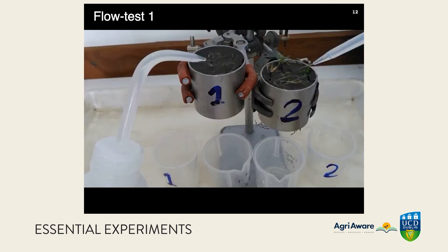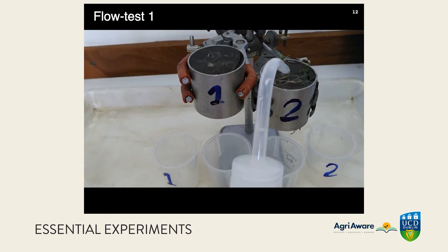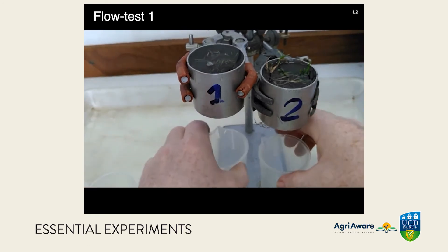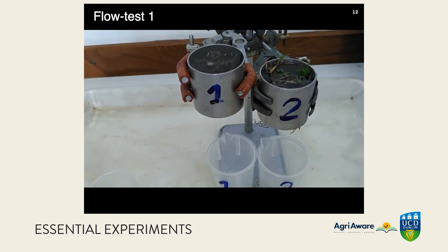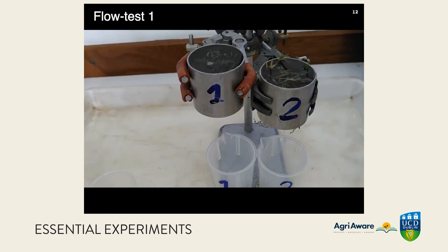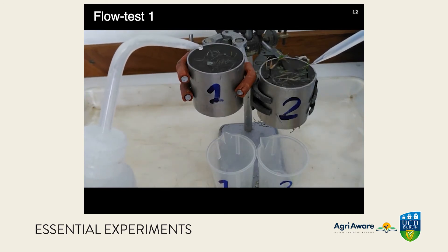Now starting flow test one. Getting the ring completely filled with water so the meniscus is bulging above the top edge of the ring. Starting the timer — it takes a couple of seconds to swap the beakers, but we correct for that at the end. We then leave them to run for three minutes, keeping the water topped up to the standard level, which is the top edge of the ring in both cases.